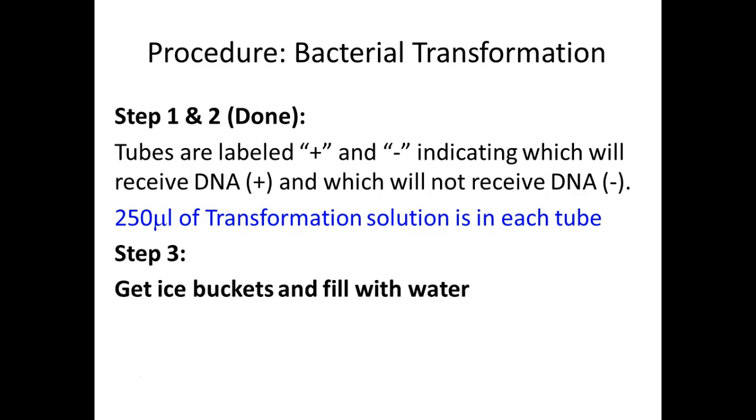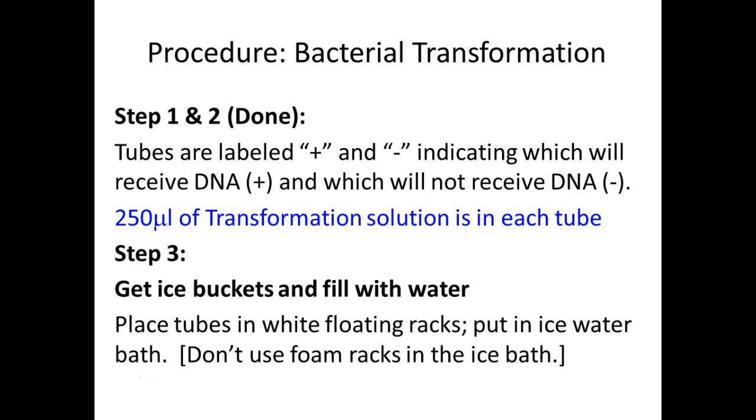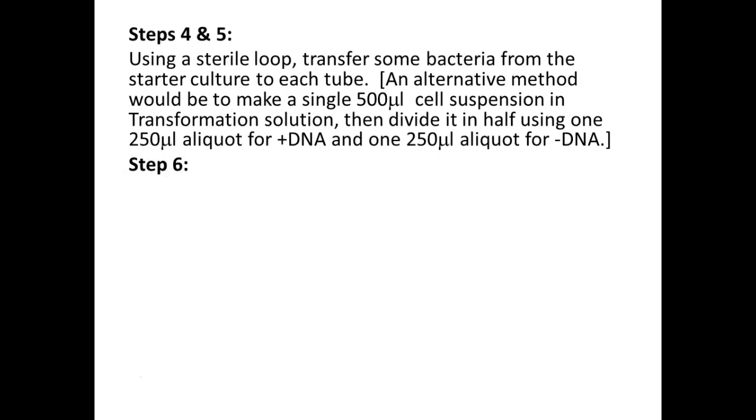So we're going to use ice buckets filled with water. And we're going to place our white racks that you see there in the back. These actually will float. We're not going to use the foam racks that come in your kit. Those I just used to hold the tubes in your kits, so they're not floating around in your boxes.